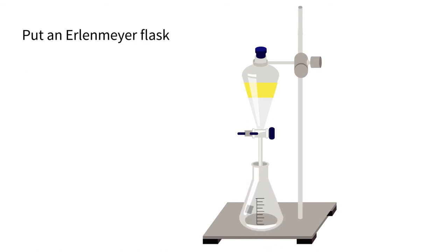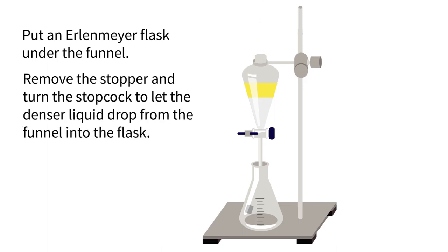Put an Erlenmeyer flask under the funnel. Remove the stopper and turn the stopcock to let the denser liquid drop from the funnel into the flask.